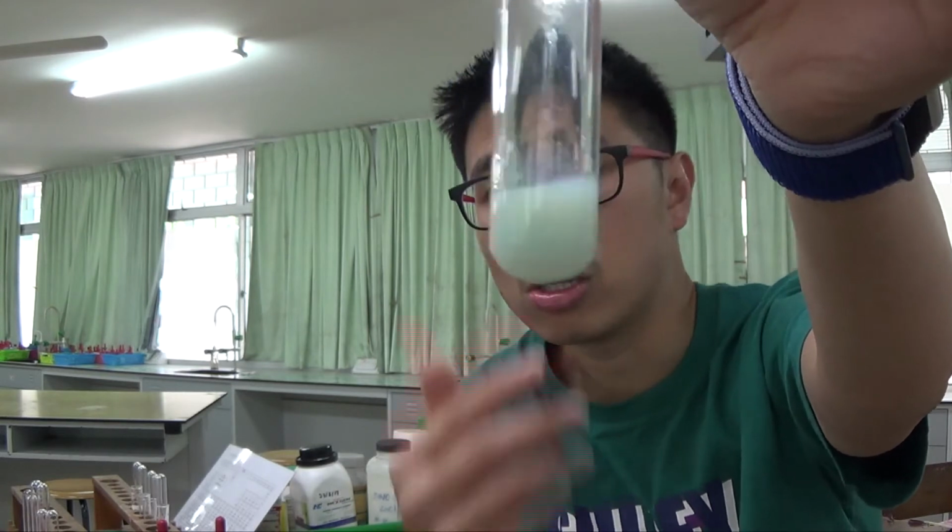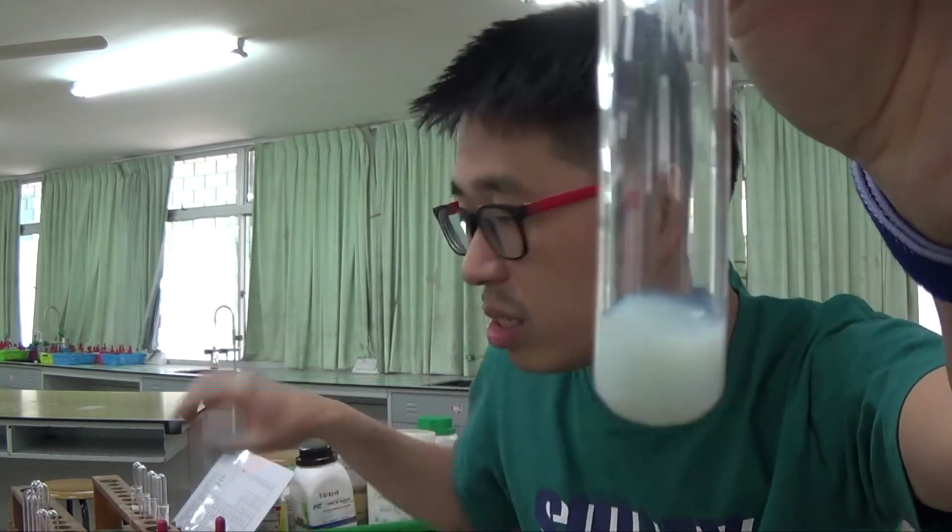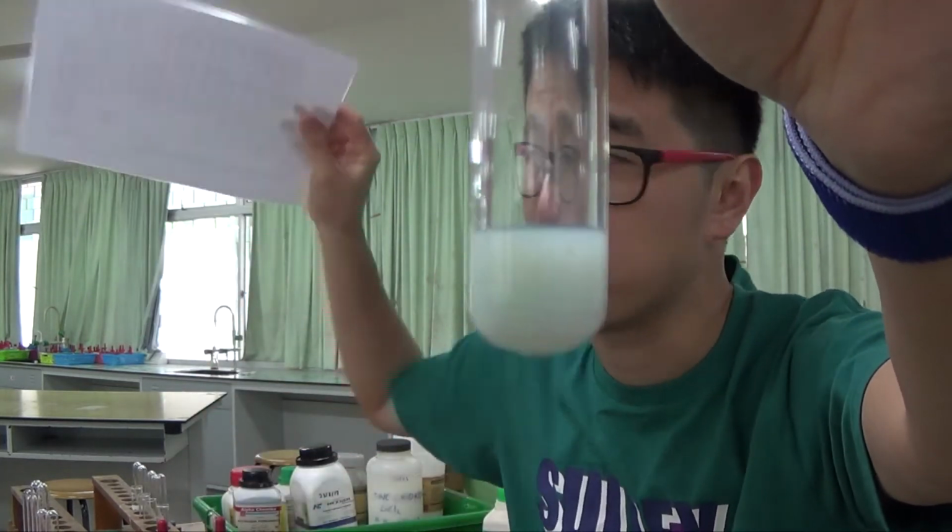And what do you see? You definitely get a precipitate. The question now is, because of the light green color of the chromium 3, you might mistakenly think that this is a green precipitate. This is very clearly not a green precipitate. It's actually a white precipitate, but it's very difficult. It's very difficult to identify the anions with silver nitrate because your cations give you the colored solution.